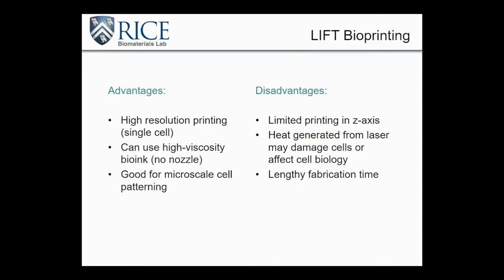And the heat generated from the laser may damage the cells or affect the cellular biology further down the line, so your tissue isn't that functional living tissue that you intended it to be. Because it is such high resolution, it does affect the fabrication time. So that's another thing that you have to consider, is how long these cells are sitting here in the bioink as well as on the cell substrate.